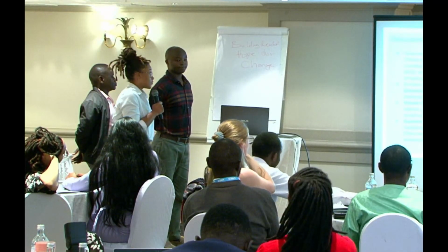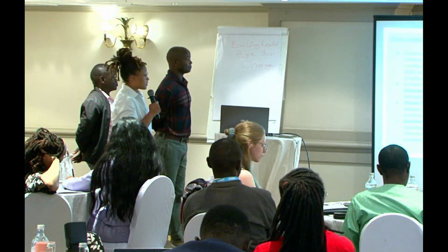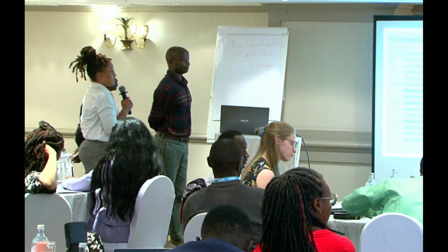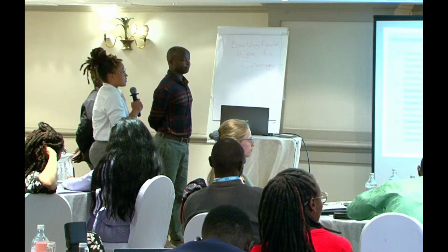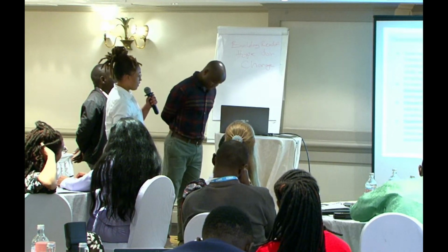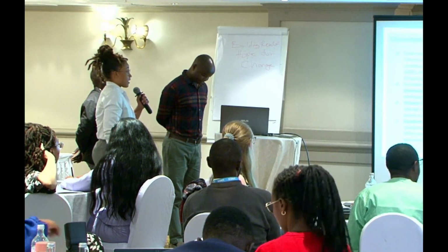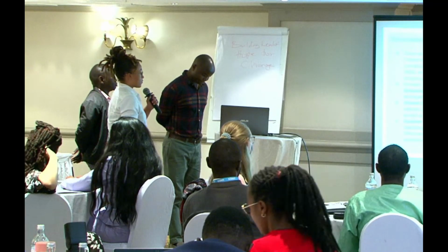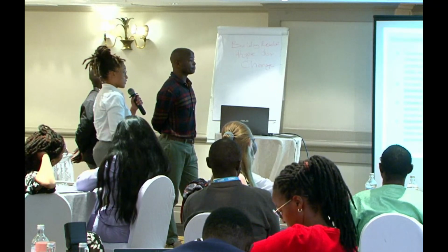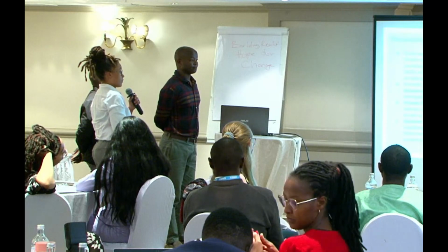For the bark samples, vitamin E displayed the highest percentage in abundance, followed by gamma-sitosterol, contributing to the bioactivity properties such as anti-hyperglycemic and anti-hyperlipidemic activities. Vitamin E, which is the triple R alpha tocopherol, showed antioxidant properties as well as it protects the cells from free radicals. Also contributes medicinally to cancer risk reduction, eye and heart health protection, as well as immune system function by maintaining healthy blood vessels.